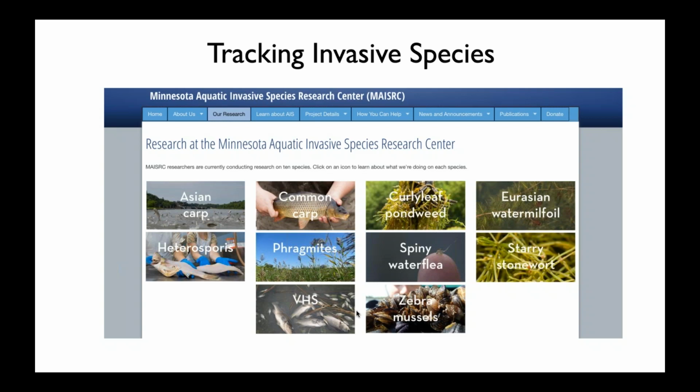And if everybody's done PCR before, you know that sometimes it just doesn't work. And so you can get a lot of false positives and false negatives with that approach. But it's also very limited, right? You're only looking at one species for that one water sample. And so what we're hoping to start testing this summer is actually broadening this out and saying, okay, let's amplify a common eukaryotic gene that all of these species should have.